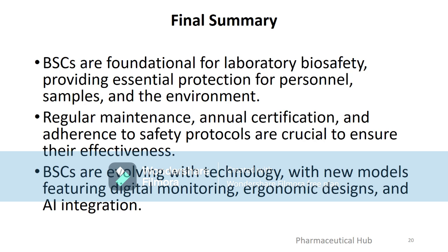Slide 20. Final summary. BSCs are foundational for laboratory biosafety, providing essential protection for personnel, samples, and the environment. Regular maintenance, annual certification, and adherence to safety protocols are crucial to ensure their effectiveness.